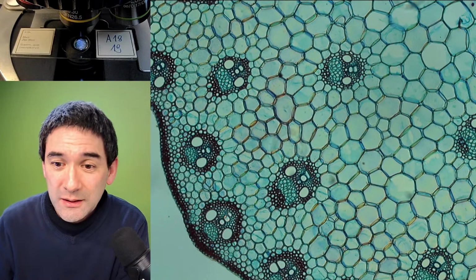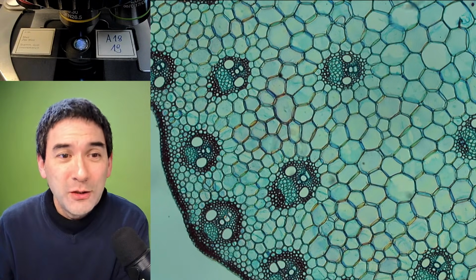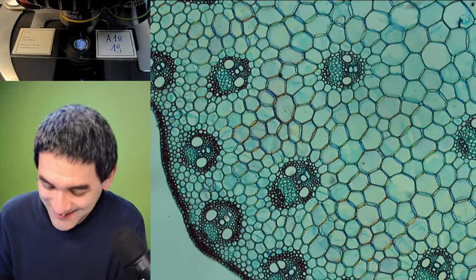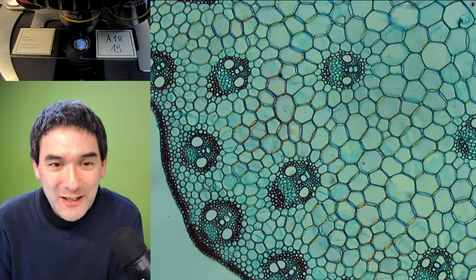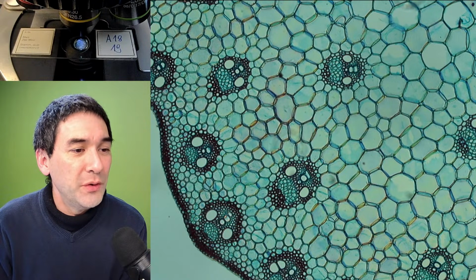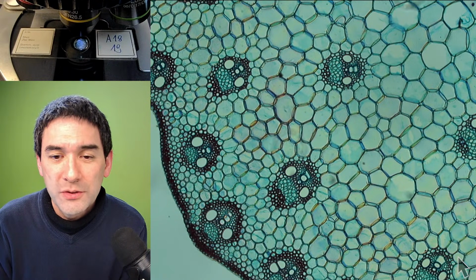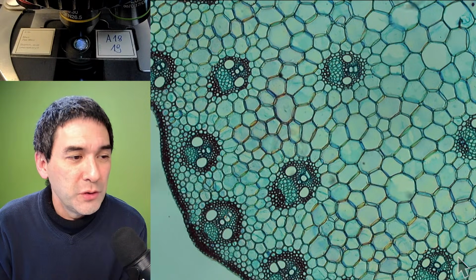The vascular bundles look a little bit like faces, almost like skulls. By the way, I can turn on the arrow, but I think it's not visible on the live on the short, the vertical one, I mean.